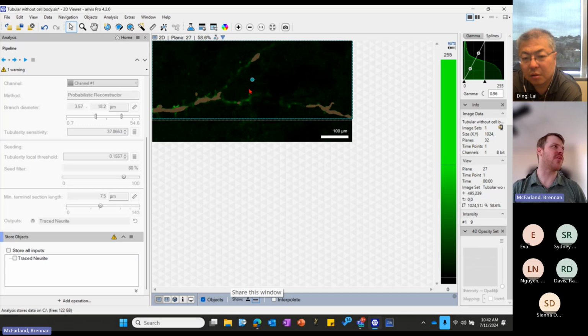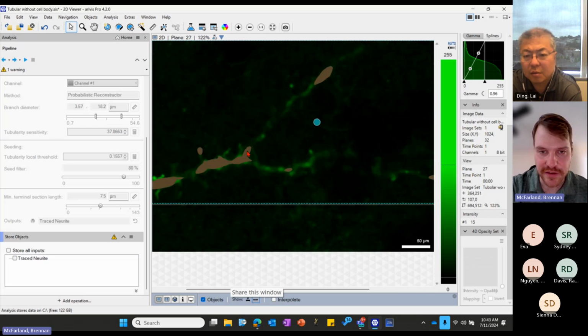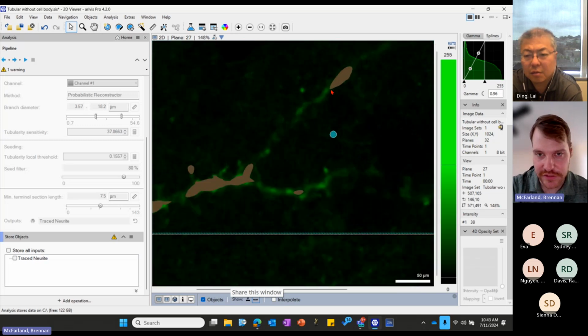And then we will go into this, I think, on Tuesday when we go into colocalization. But one of the things with colocalization, or if you want to do distance measurements, not quite colocalization but the same idea, if you're looking at relationships between two objects, you can say, if I have object A and object B, measure from the surface, so just on the outside of this object, to the outside of another object.